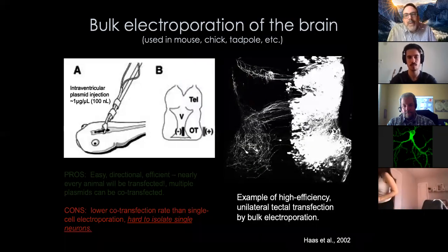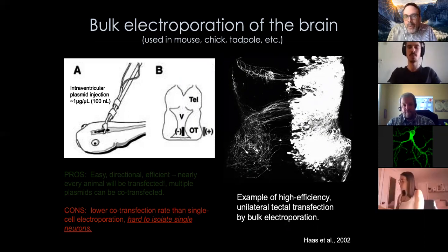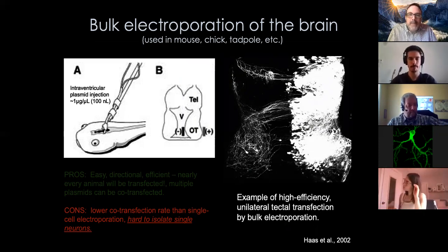So there's another way to get labeling using electroporation that doesn't give you single cells, but it's really, really efficient and easy, and that's the bulk electroporation approach. It's the thing that probably most mouse labs would be using. You can do it in the spinal cord, you can do it in early development in utero, and label cortex very easily, or hippocampus.